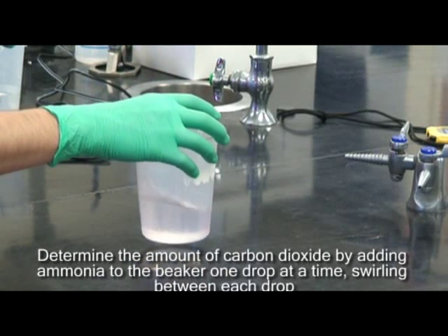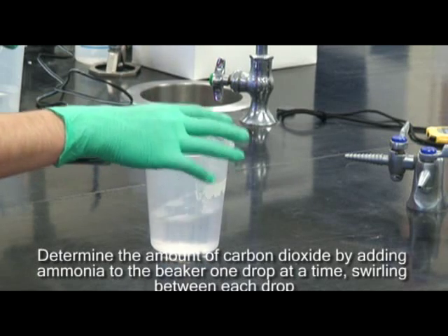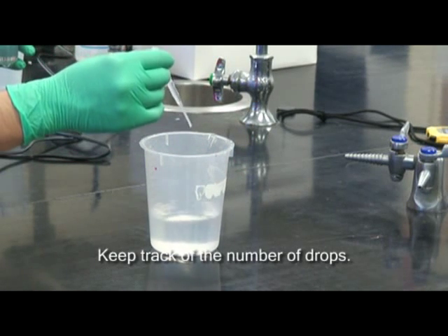Determine the amount of carbon dioxide by adding ammonia to the beaker one drop at a time and swirling between drops. Keep track of the number of drops and record your result.